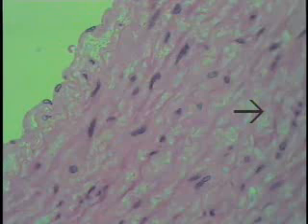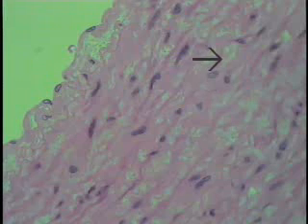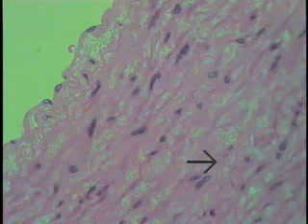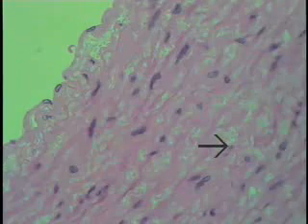And this is a protective mechanism, and also allows this vessel, once it has expanded, to go back to its normal dimensions. Most of the nuclei seen here at various angles, most but not all, are smooth muscle cells. The others are fibroblast nuclei that lie between those spaces, or regions between the elastic laminae. Remember, of these sheets, there's probably going to be 50 to 60, maybe even 70, depending on the section. And those are these homogeneous undulating strands shown at the tip of the pointer.